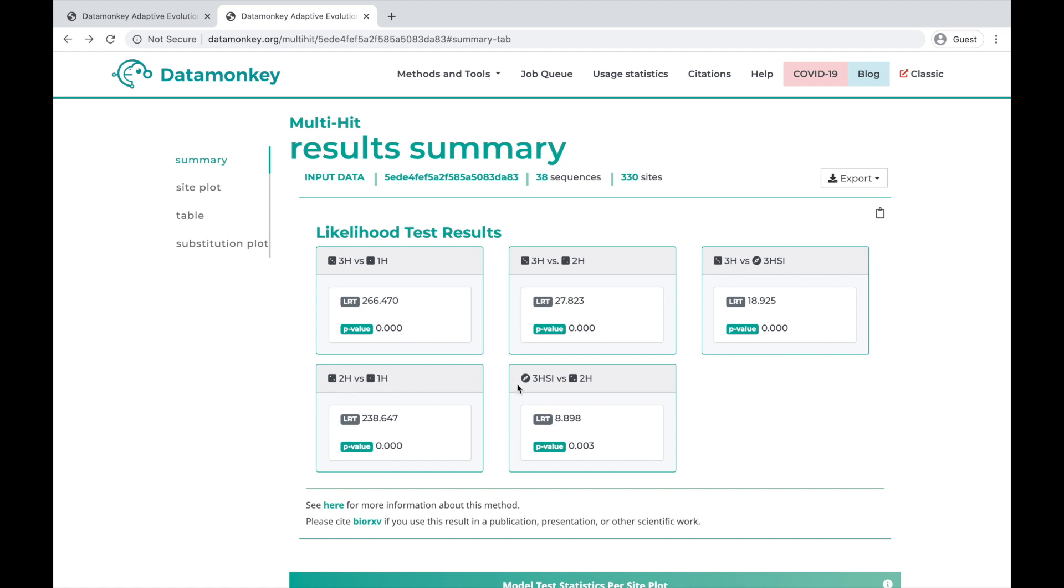And here we see one that is the triple-hit synonymous island versus the double-hit. Each of these tests have the likelihood ratio test statistic and a p-value associated with that.